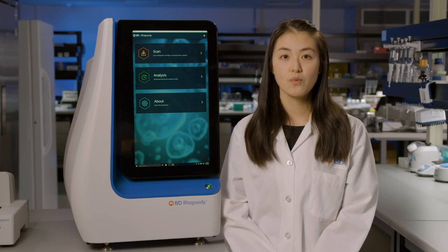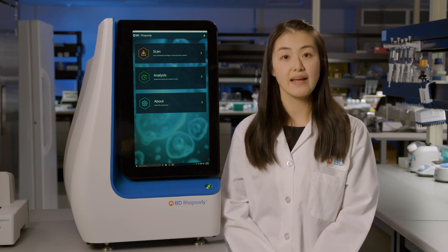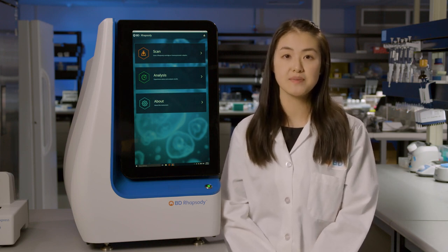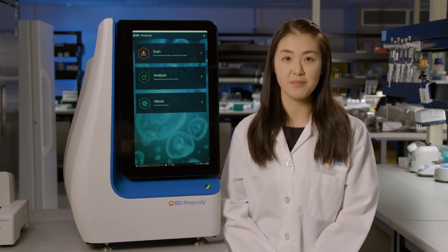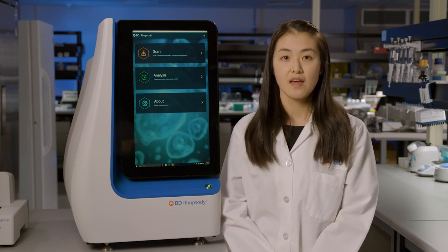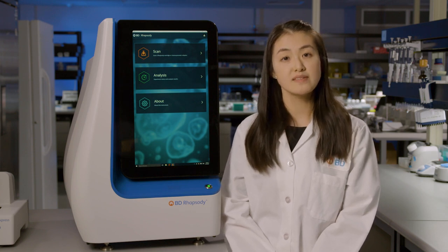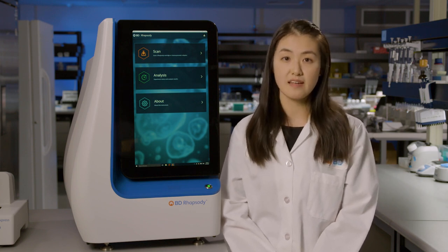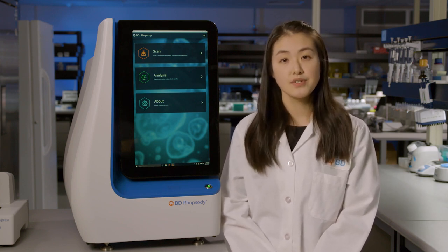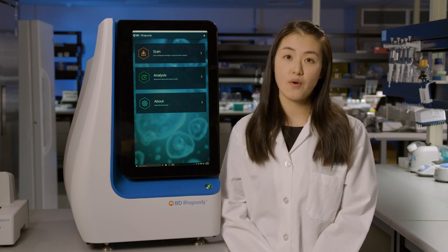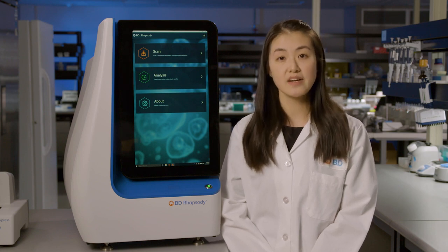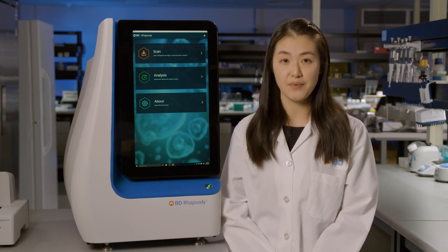In this video, we will walk you through the example of pooling the BD Rhapsody system libraries for sequencing. If you're working with a sequencing facility or provider, make sure to discuss their requirements and recommendations prior to pooling your libraries.